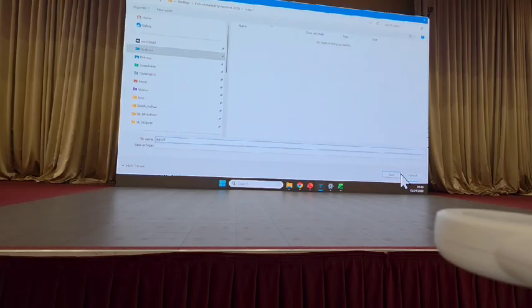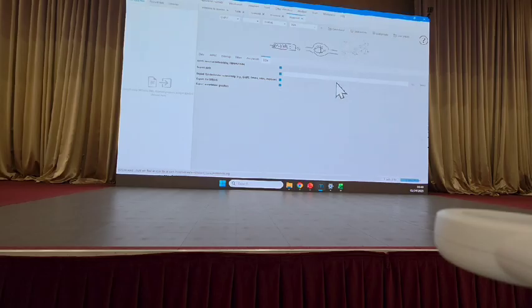KMOS, Korean Metabolomic Society, MZmine workshop. I'll save, and it will update here in a second. And I will also have export for molecular networking checked, export for SIRIUS checked, and I will not select export annotation graphics, it will just slow it down.